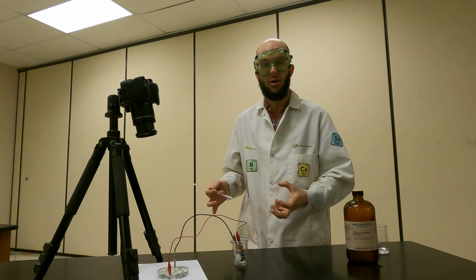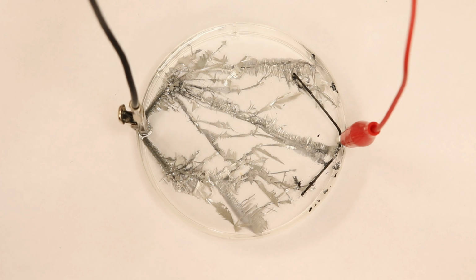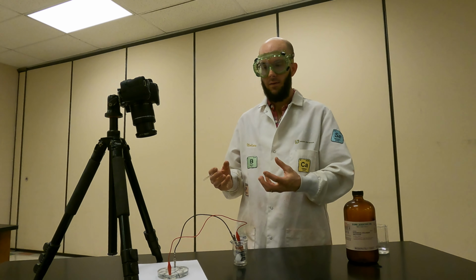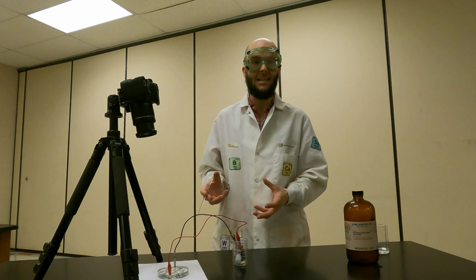So this is a pretty dramatic reaction. Out of that tin chloride solution, we have the appearance of this silvery solid. This is pretty astounding. What do you think that silvery solid is? Well, it turns out that what that solid is tin metal.